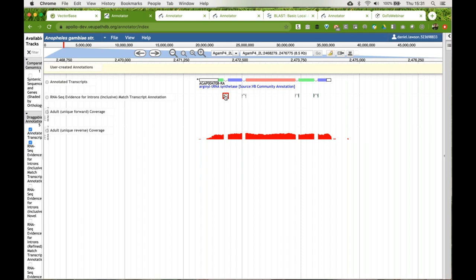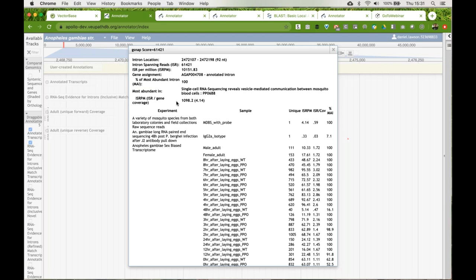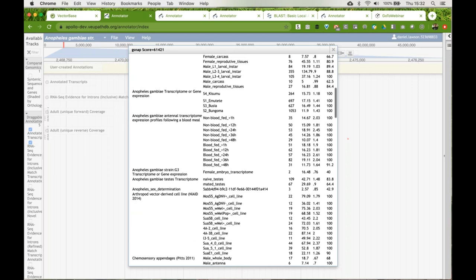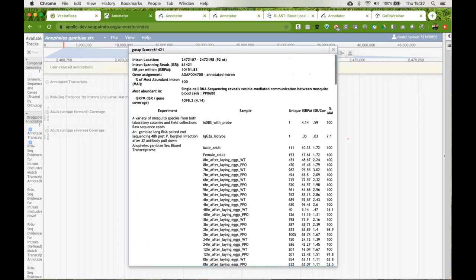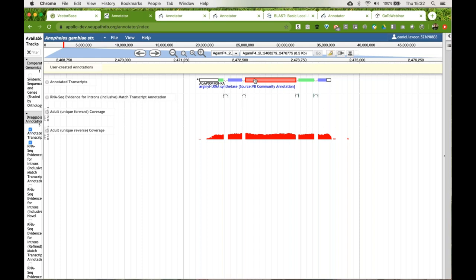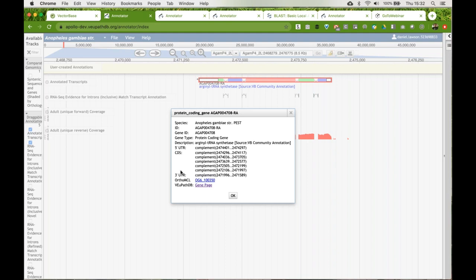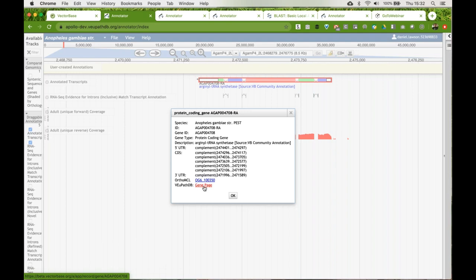These tracks are also interactive. You can click on a feature from the introns to find out more details. For those who attended the webinar on how to use RNA-seq, this gives you all the information about the alignments and mapping of this intron — how many times reads actually span the intron, which gene it aligns to, and its representation and frequency count across all the different experiments. Clicking on the gene model with control-click brings up a menu showing summary information about the species, the ID, where the coding sequence and UTRs are, and link-outs to OrthoMCL or to the main site gene page.